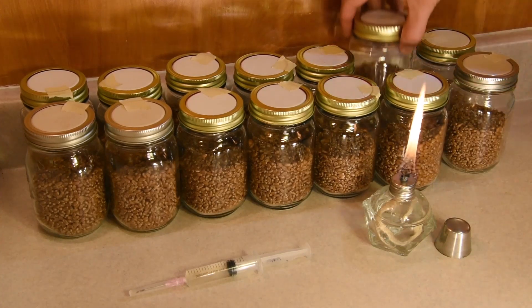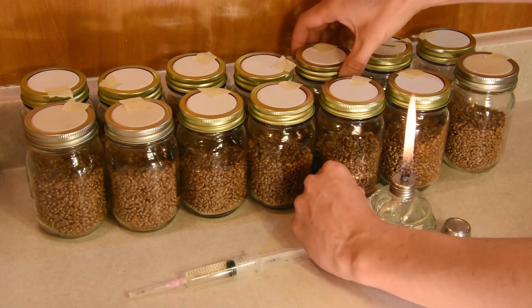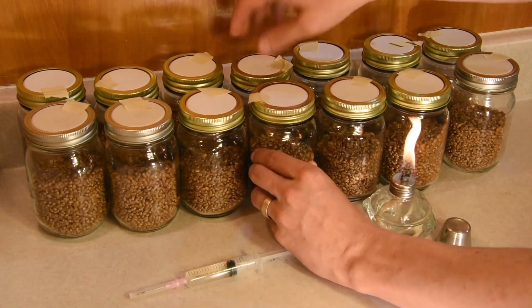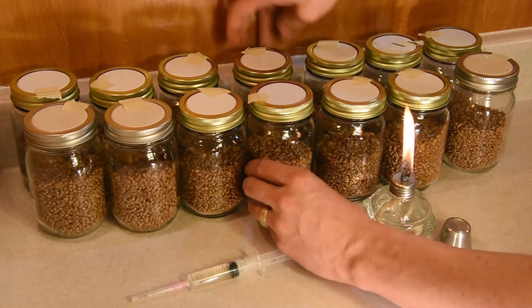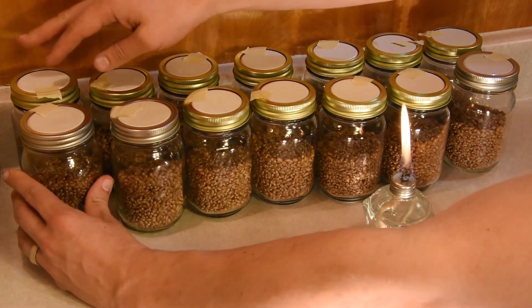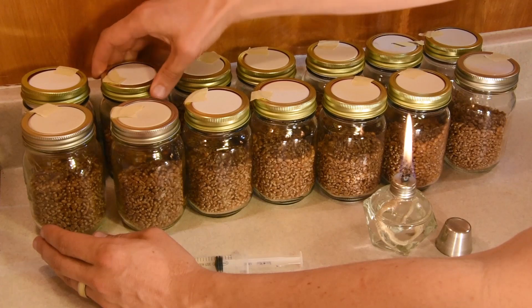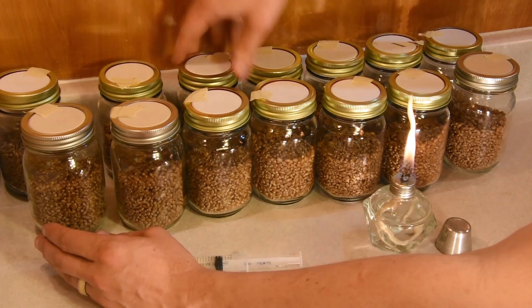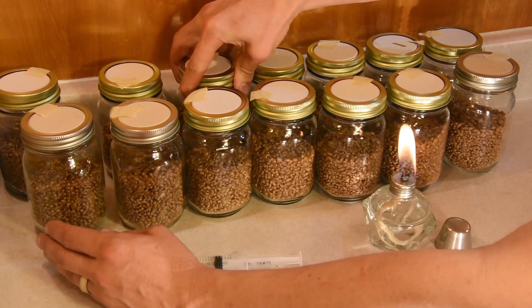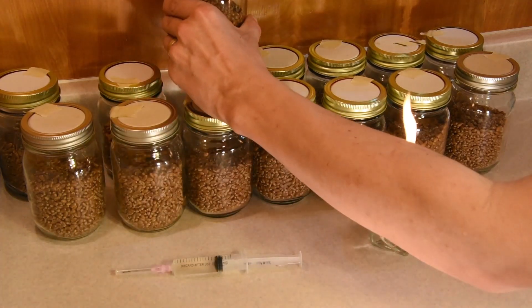My first step is to loosen all the lids. I definitely don't want to open them all the way, but I want to make sure I'm not going to have to fumble around while I'm in the middle of things. If I was in the middle of inoculation and had to set something down to loosen the lid, that would be a fumble. So I'm trying to make sure all the mistakes happen before I get started.